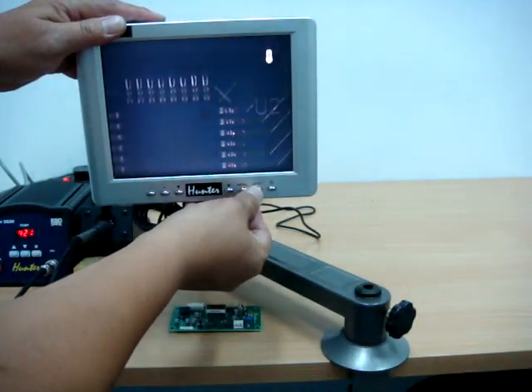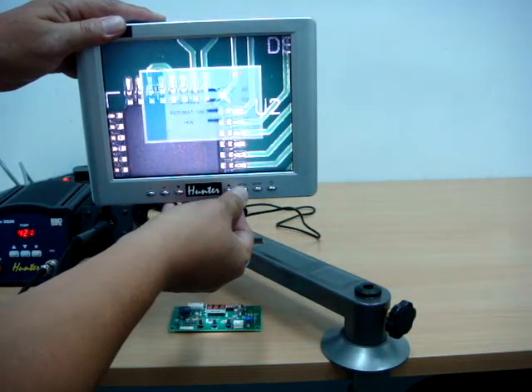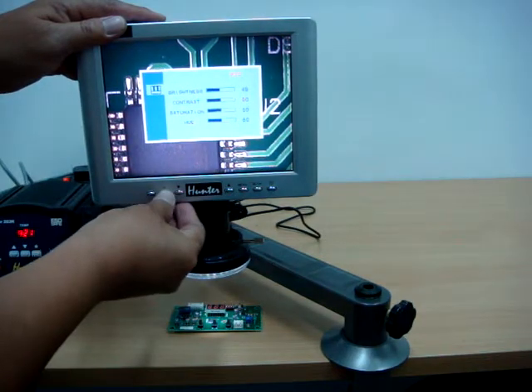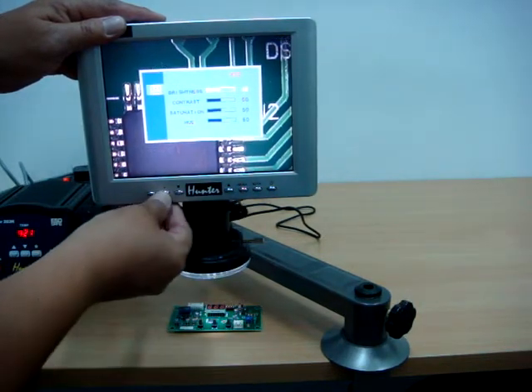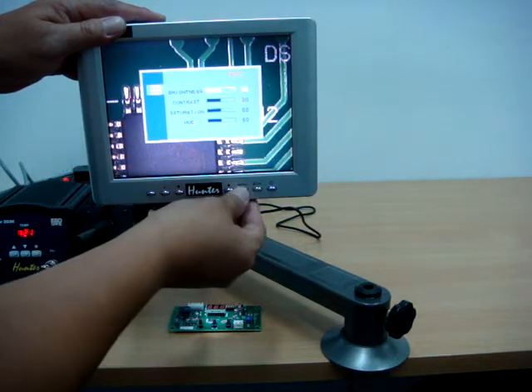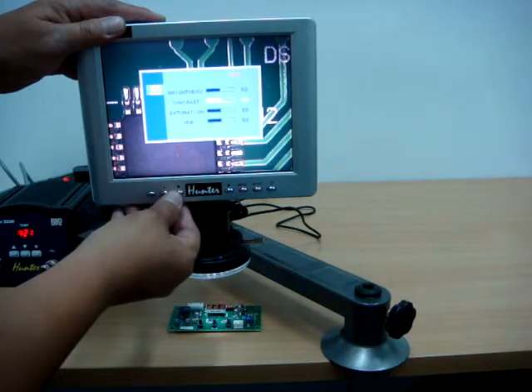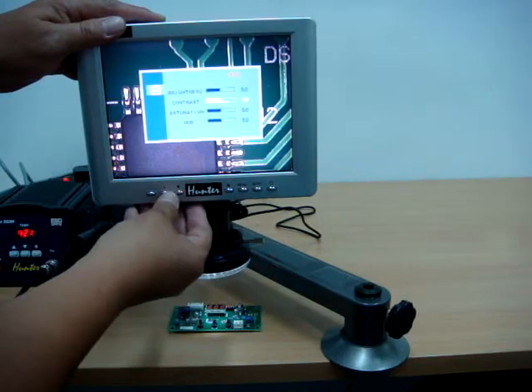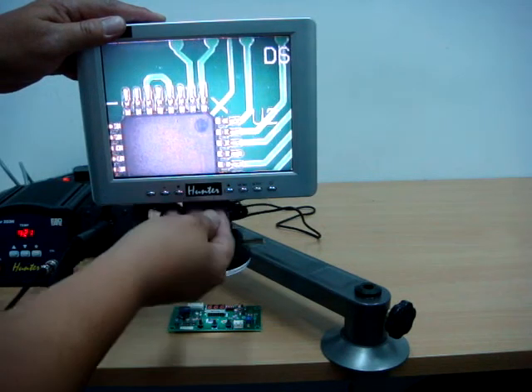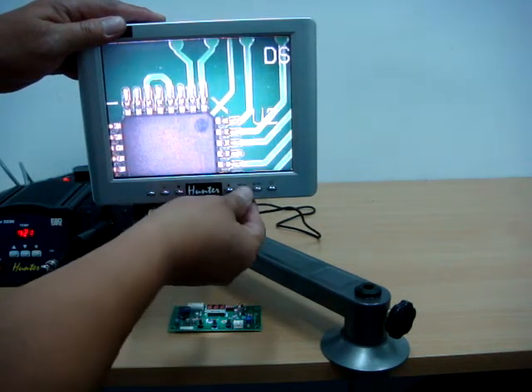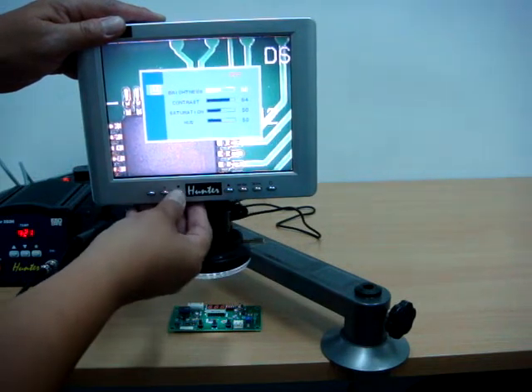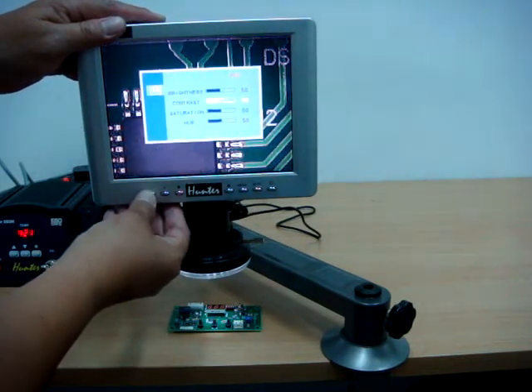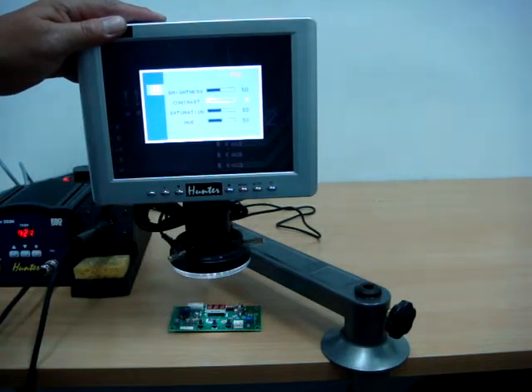This is the on/off light. This is the menu so you can adjust whatever brightness you need. For the contrast, you can just move down - this will be the one to adjust the contrast. You can see the contrast light and even re-adjust the contrast again until it's very dark.